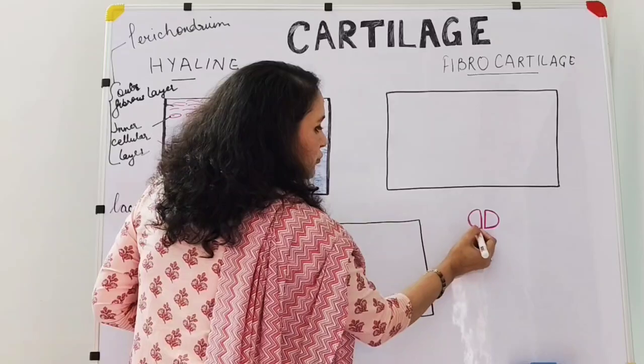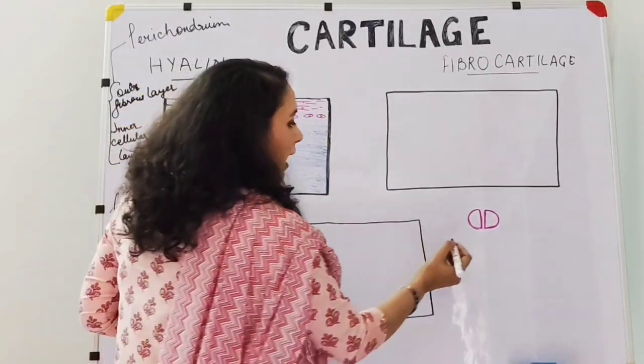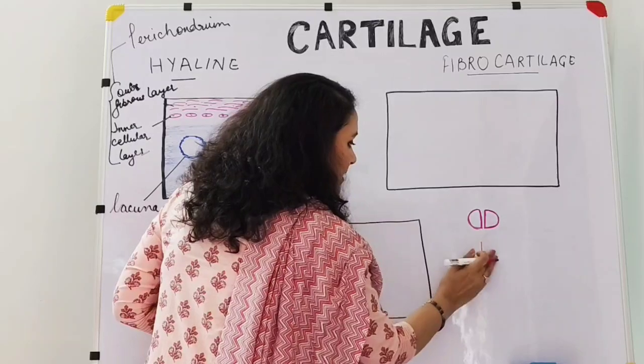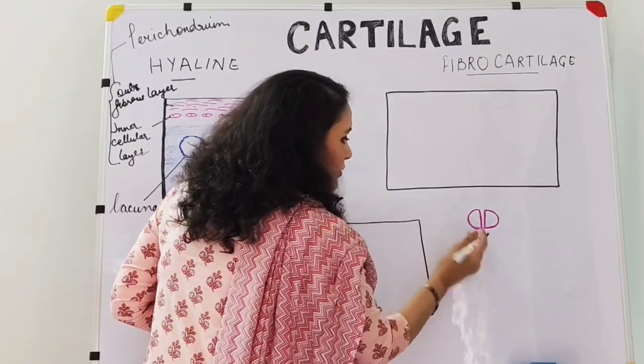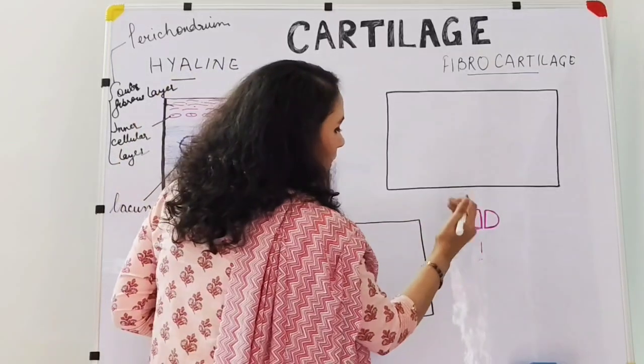They will be straighter, like this, flat. You can call it as flat. And suppose these cells have further divided, so this is one D and the other is the mirror image of it, opposite, an inverted D.